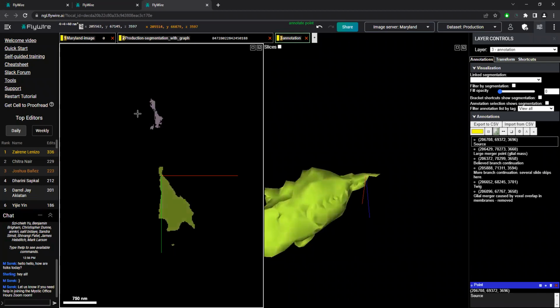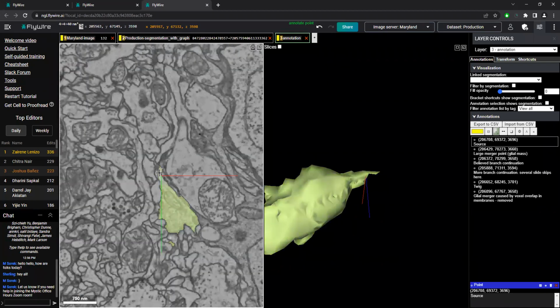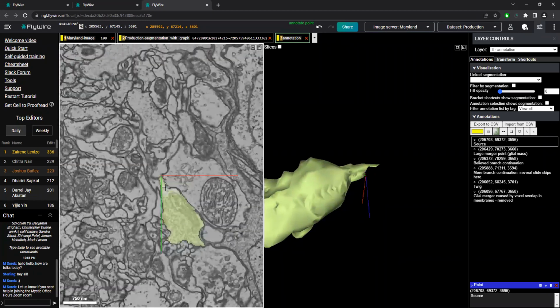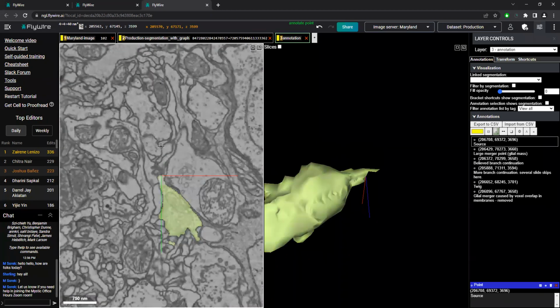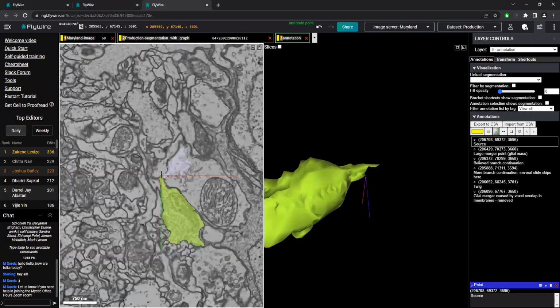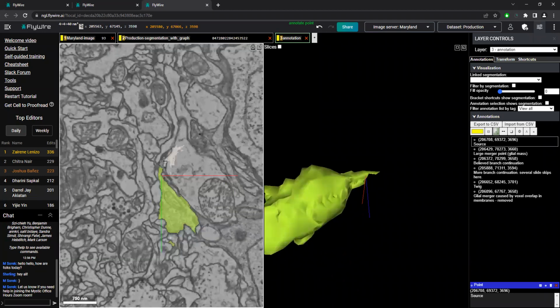So basically, we're going to follow the flow of this point here. We know, based on how it's growing, that we started down here and it's growing up in this direction, not exactly left and up, but up around here. So this looks like it could continue on.